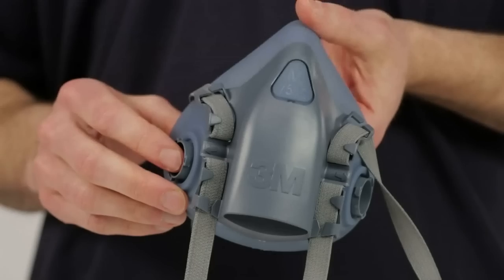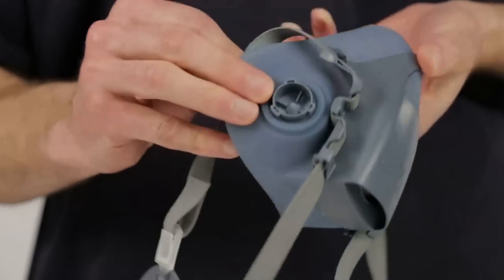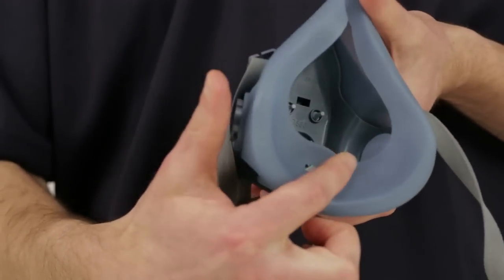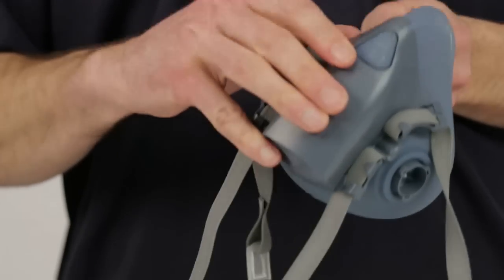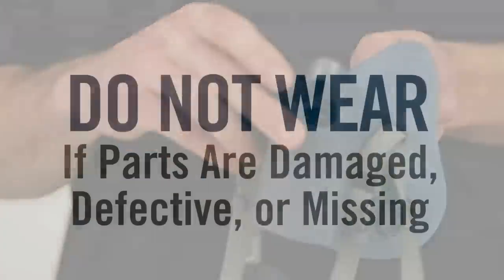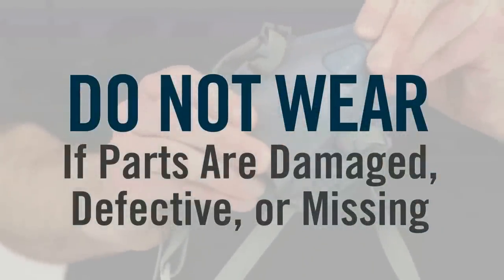Before each use of your half-face-piece respirator, inspect it for any signs of damage. Check the face piece, gaskets, straps, and all plastic parts and valves for distortions, cracks, tears, and dirt. Your respirator will not function correctly and your health could be jeopardized if your respirator has damaged or defective parts. If it does, replace them before using the respirator.